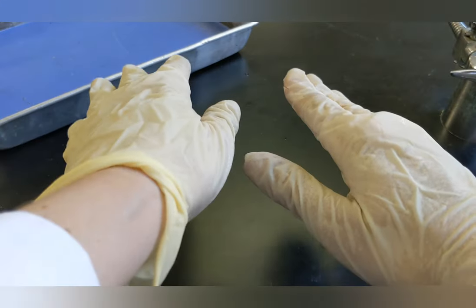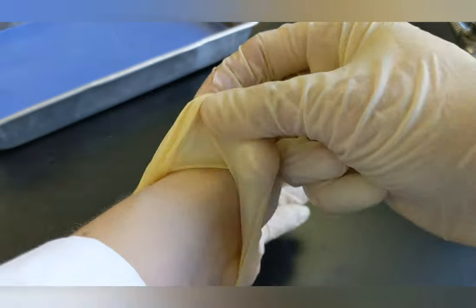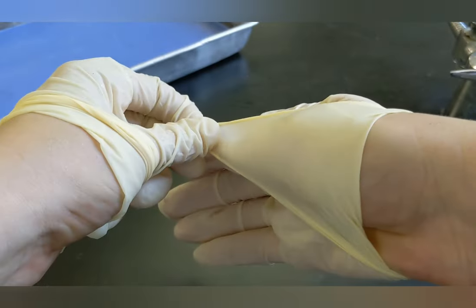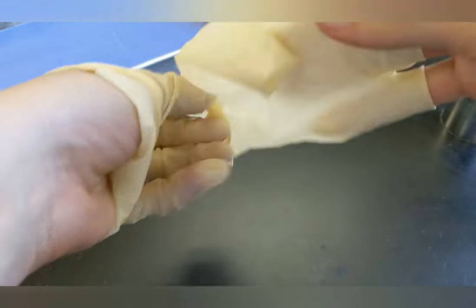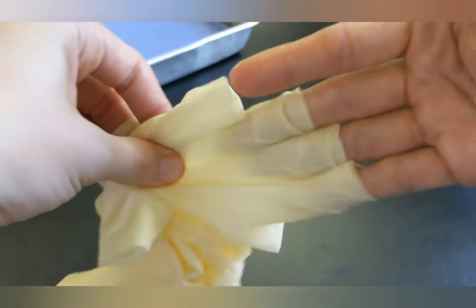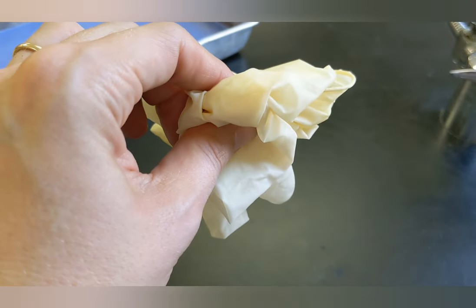The final step is glove removal. To do this, grab the outside edge of your glove without touching your skin and peel it down a bit. Then grab the other one and peel it down a bit. Your goal is to basically turn your gloves inside out without touching any of the contaminated surface. Then you can throw them away inside out and wash your hands.